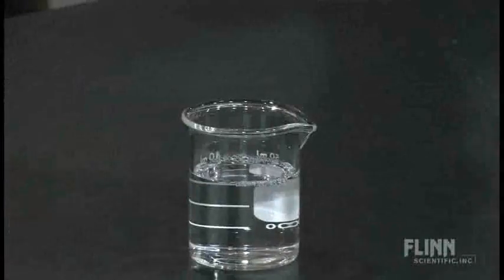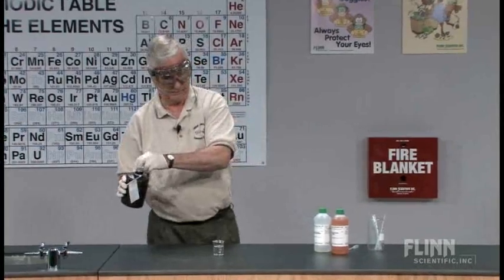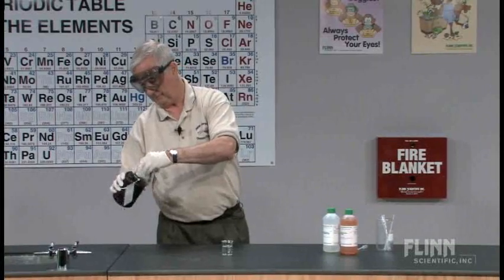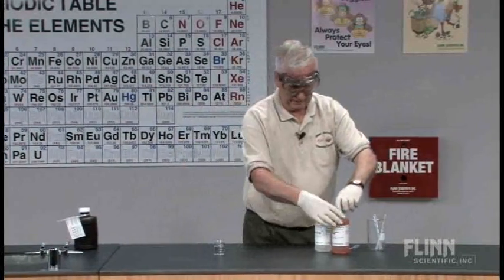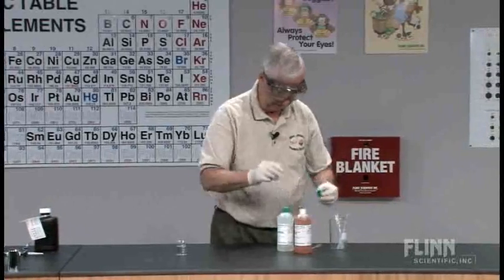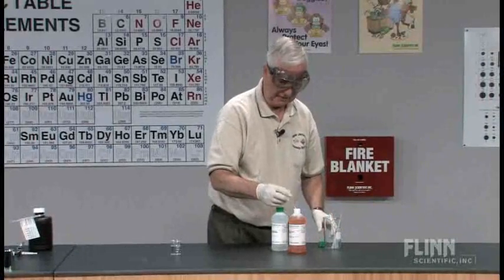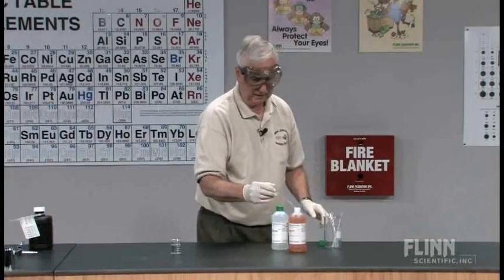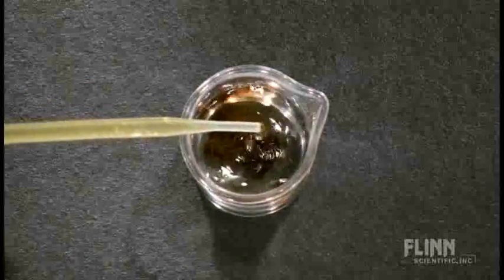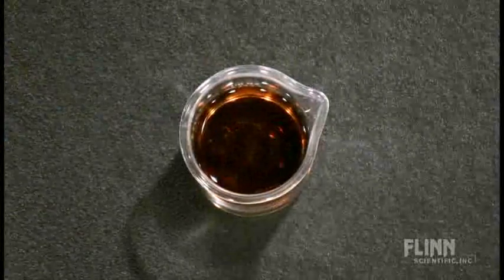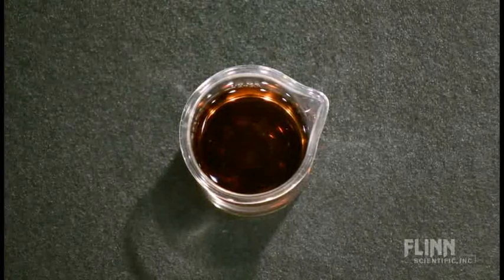Now, for our catalyst, we're going to use iron nitrate. Iron nitrate, the iron ion, catalyzes the reaction. We're going to add a small quantity to the peroxide.